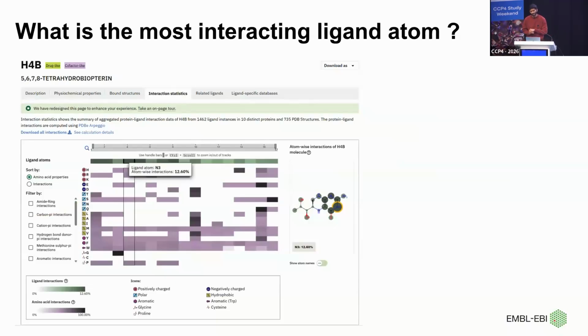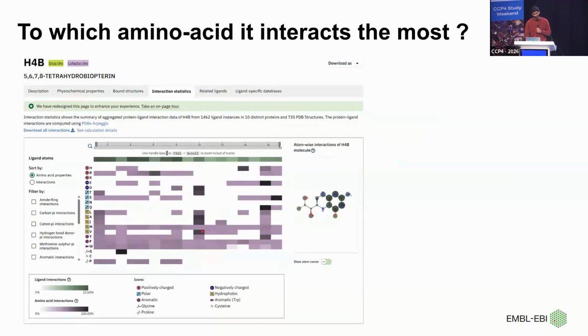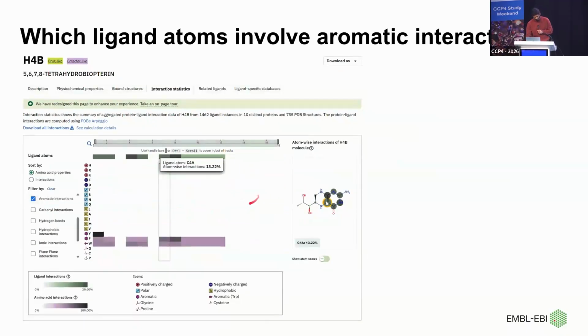It calculates 15 types of interactions, and the default view shows the aggregated information for all interaction types. But you can also filter by type of interaction, and the statistics get updated accordingly. These are all interactive, so if you are following along, you can check how they vary. If I update to aromatic interaction, all the values get updated to include just that type of interaction.